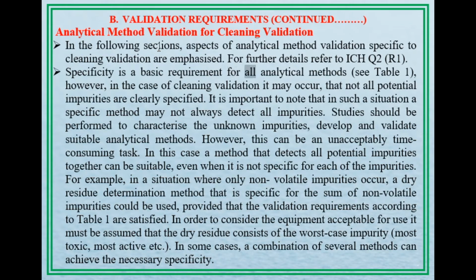Specificity is a basic requirement for all analytical methods. See Table 1. However, in the case of cleaning validation, it may occur that not all potential impurities are clearly specified. It is important to note that in such a situation, a specific method may not always detect all impurities. Studies should be performed to characterize the unknown impurities, develop and validate suitable analytical methods. However, this can be an unacceptably time-consuming task. In this case, a method that detects all potential impurities together can be suitable, even when it is not specific for each of the impurities.